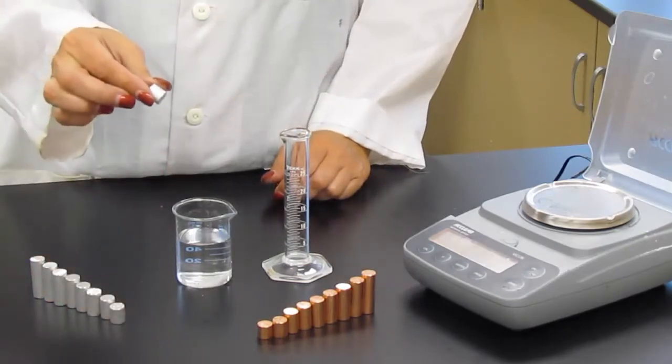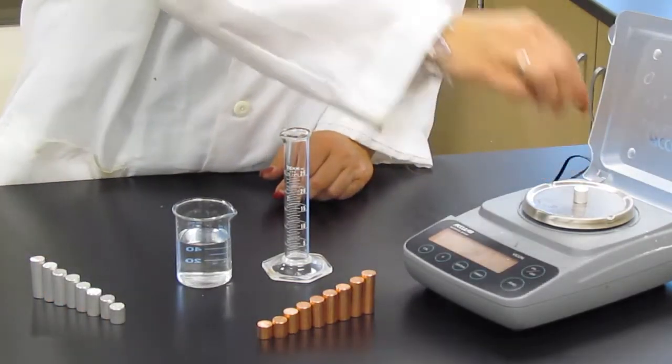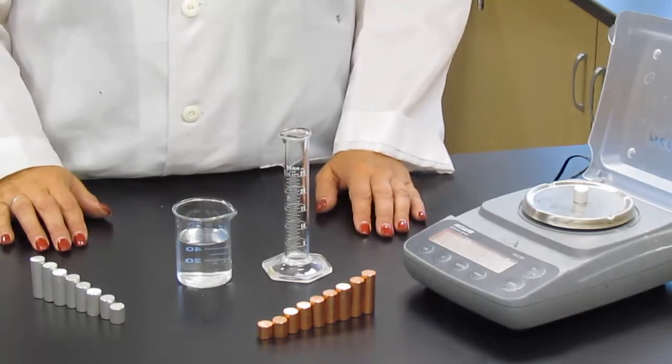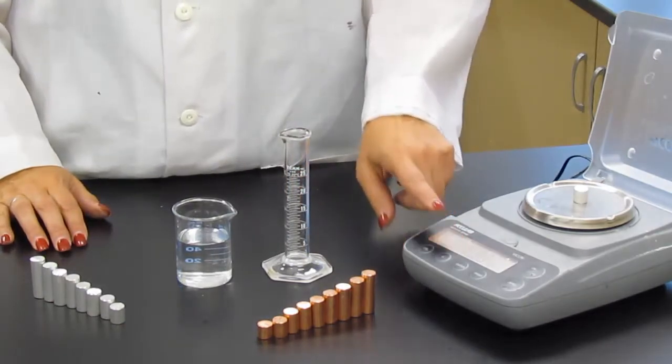First thing you're going to do is find the mass of one of your cylinders. Make sure you take a reading to the correct number of sig figs.